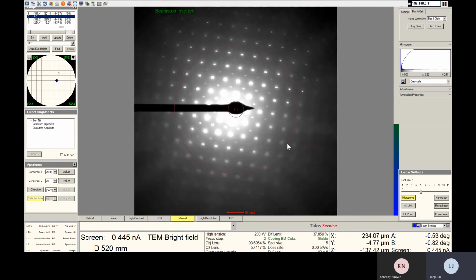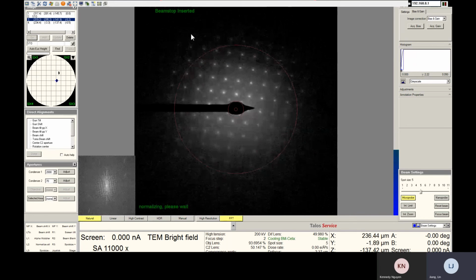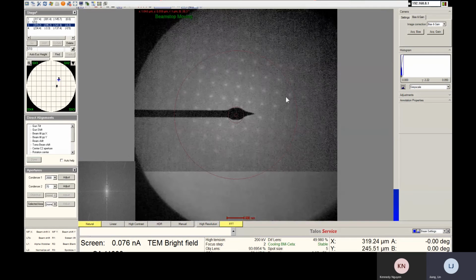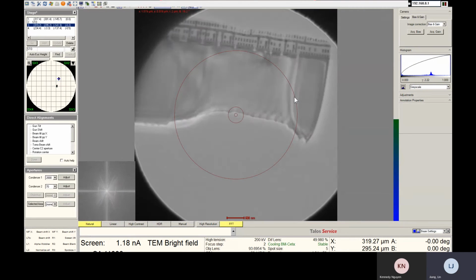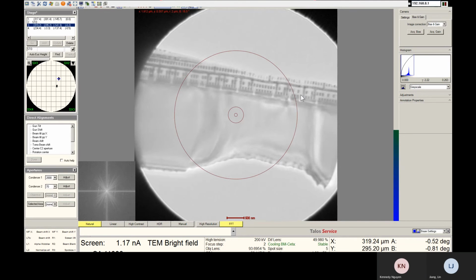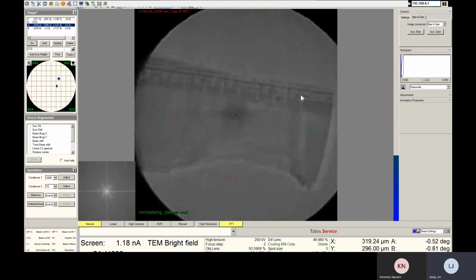Next, you can add request control. I'm gonna move to sample one, and then let's go to sample one, and you can get some diffraction patterning on that sample one. This is sample one. Okay. Let's focus.